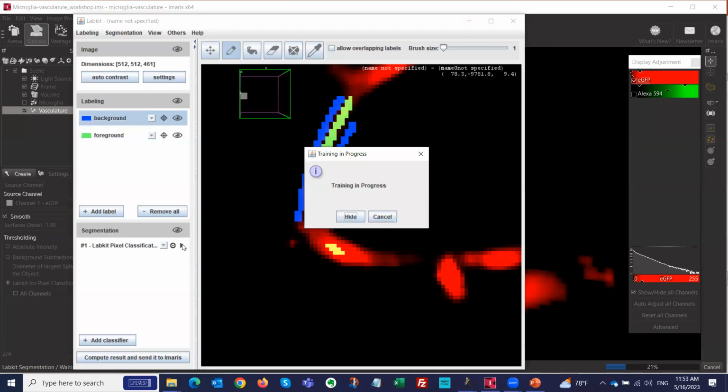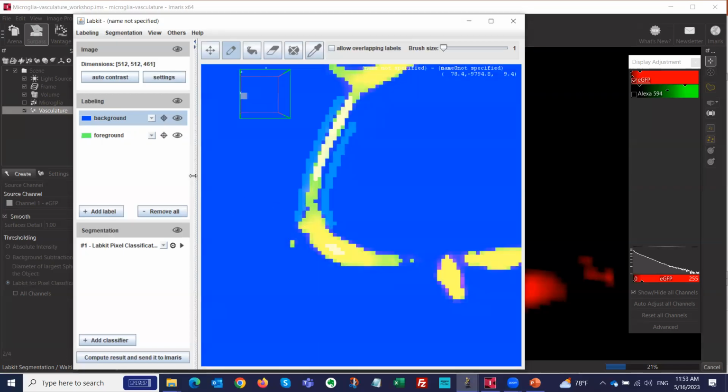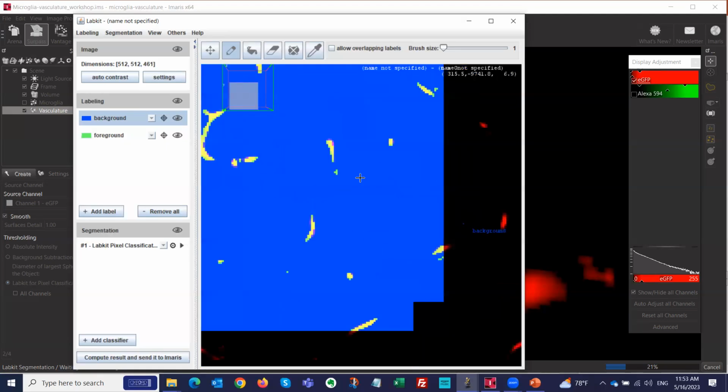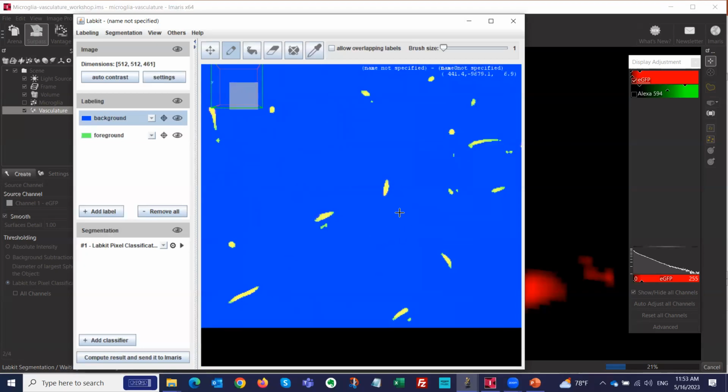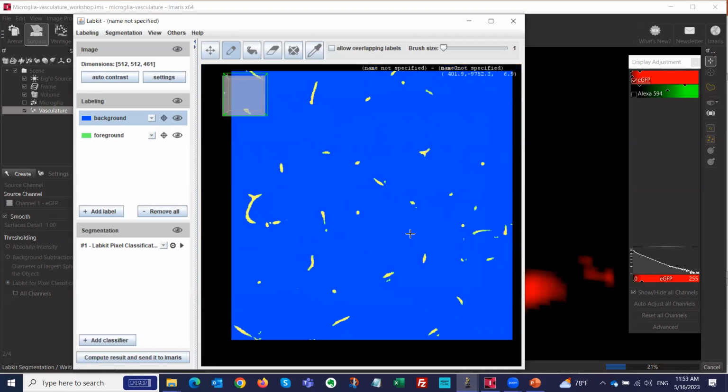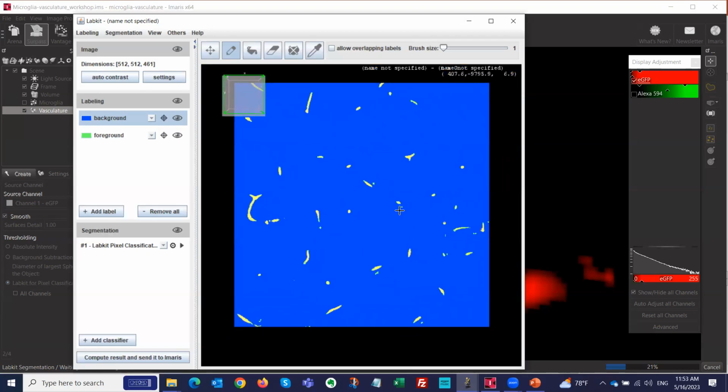You go iteration by iteration. So I'm doing 3 iterations now. I'm going to stop after this one, even if it's not perfect, but it should be pretty good. There are things here that are not perfect, but you do want to check the whole thing here. And then also, I'm in presentation here, and most of the times if I do the presentation, I just show it on one slice.